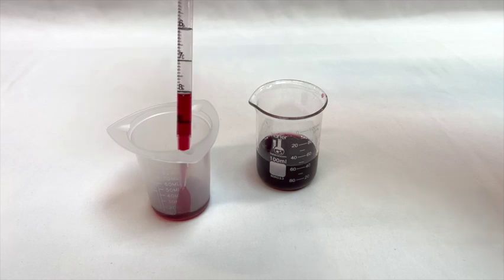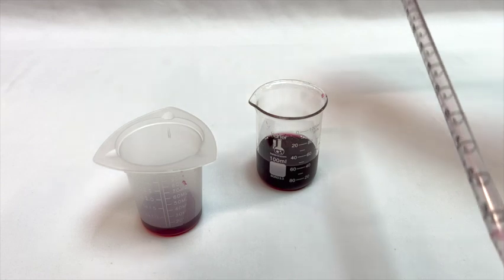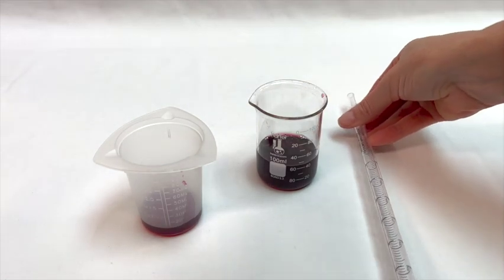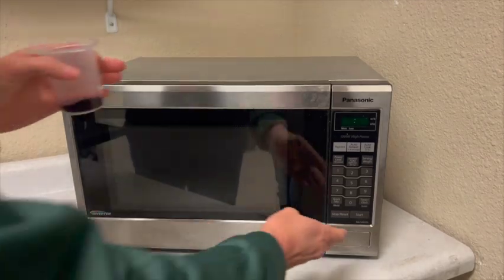We will start off by gathering our wine sample. Place 10 ml of your sample into a beaker. If you are testing multiple wines, make sure you label your beakers. Then place your sample in the microwave and boil it for about 60 seconds at medium power.